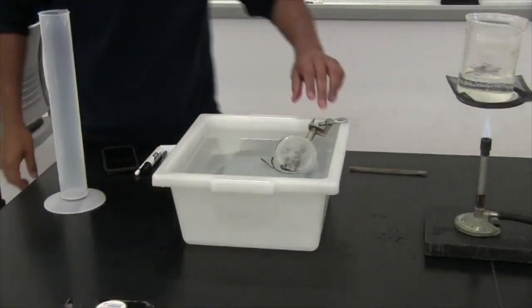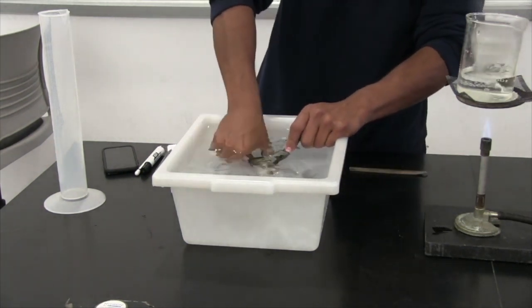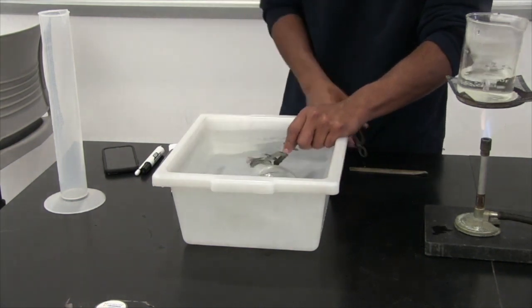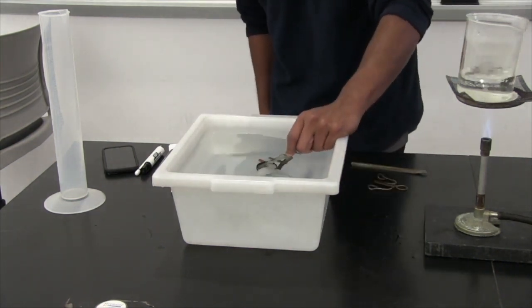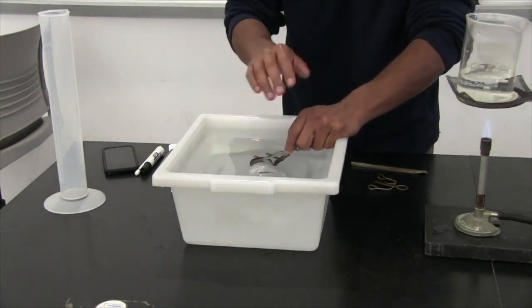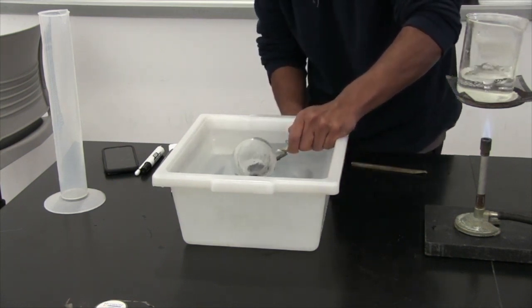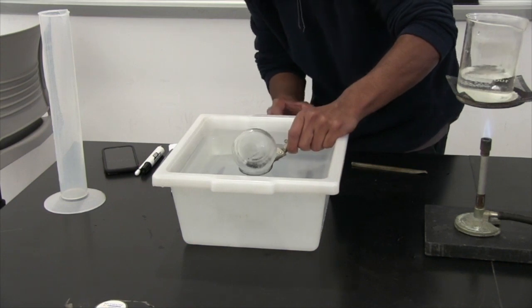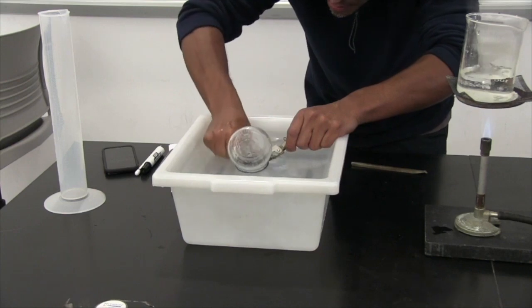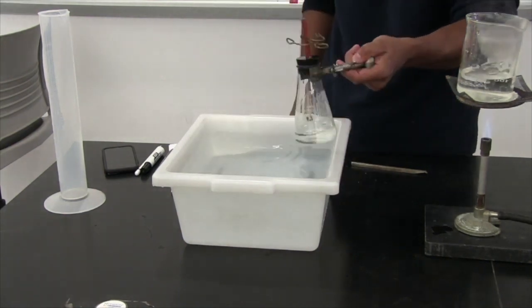Okay, so the flask has been submerged underwater for about 5 minutes. So now I'm going to remove the pinch clamp. I'm still keeping it submerged. Before I remove the flask, I have to make sure the pressure inside the flask is equal to the pressure here in the lab. And by that, I have to make sure the level of the water inside the flask is at the same level as the water inside the container here. So now I'm going to place the pinch clamp back on, and now I can remove it.